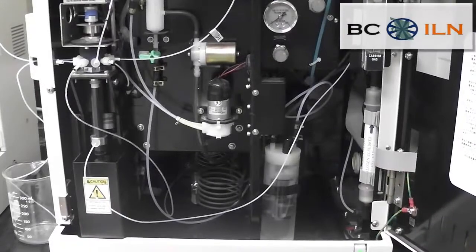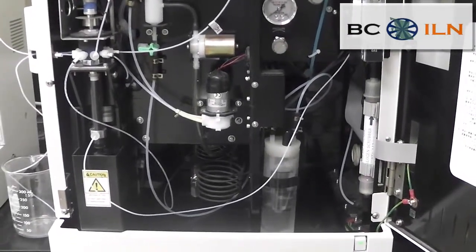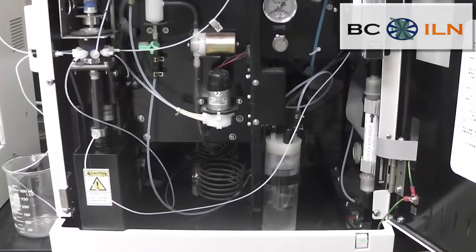When the total nitrogen has been turned to nitric oxide, it then must be cooled and dehumidified to get rid of any excess water present. For detection, all excess water must be gone.